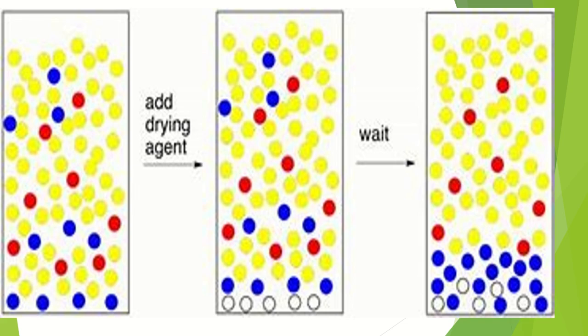And this is kind of how it works. You see the blue water molecules throughout the mixture here, and we add our white particles of anhydrous calcium chloride, and you can see the blue water molecules are now trapped at the bottom, attracted to the anhydrous compound. You simply now decant off the liquid, which means you just pour it off and keep the solid behind very carefully and very slowly, or you can filter out the liquid.